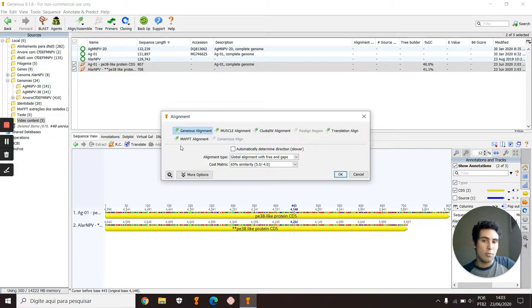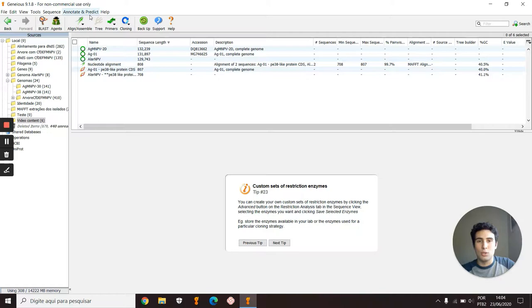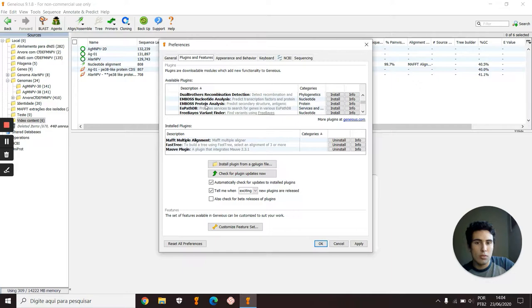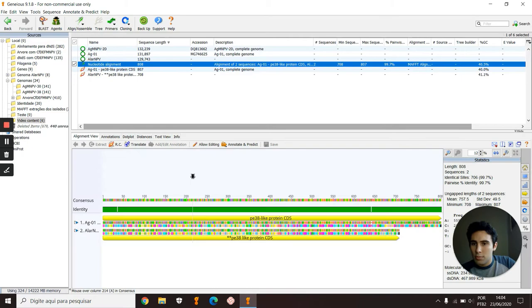We must go here in Pairwise Align and click on one of these alignments. I will go with MAFFT. It is actually a plugin, and I will show you how to download it. It is in Edit, in Tools, in Plugins. You can go right here in Available Plugins. Mine is already installed, so you just click here in Install.